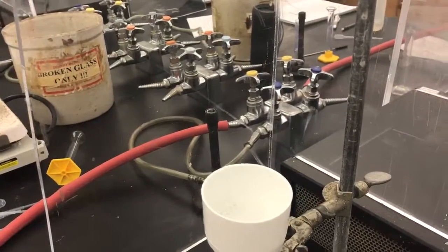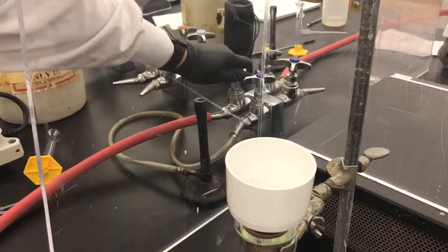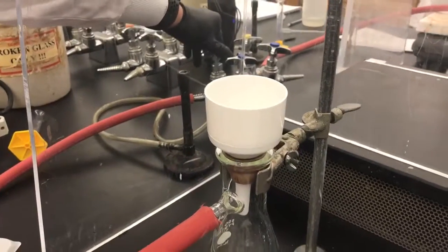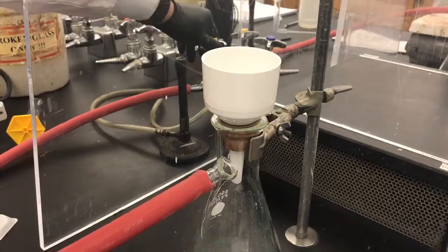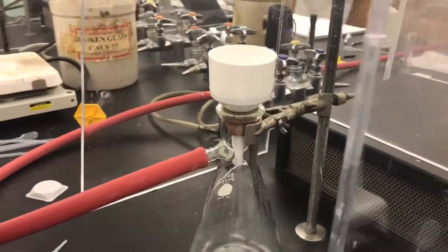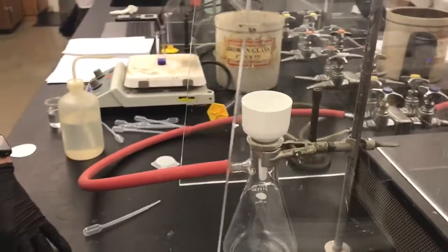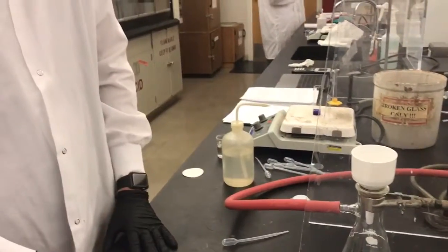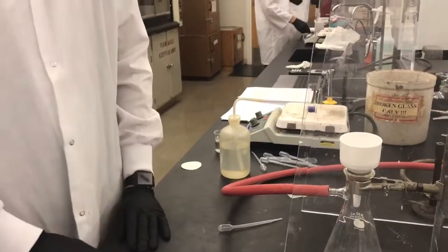Now that we have it connected, we can turn on the lab vacuum, and you can hear that the suction is starting to happen. Our filter paper is already wet, so it's stuck to the bottom of the funnel. Now we can add our crystals and decant them slowly in order to get them out.